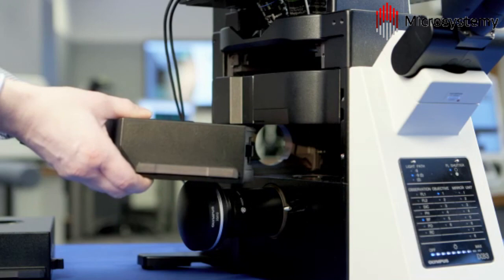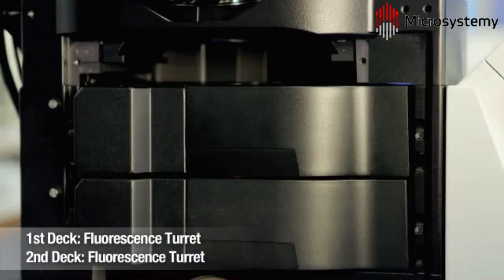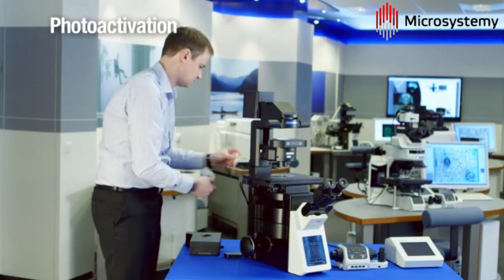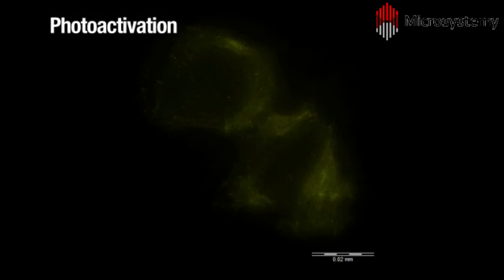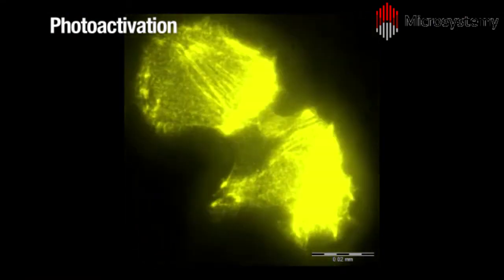Two filter turrets in the light path enables advanced imaging techniques by providing distinct light sources for imaging and activation. This is ideal for photoactivation experiments, such as this study of Actin Dynamics. Actin is fused to a photoconvertible fluorophore and activated with a burst of light for visualization.